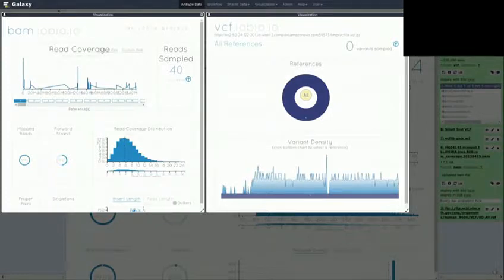And this is the same for variant files. If you have a VCF file, you can visualize your VCF files as well. This is a different interactive environment, a different Docker container, and we can talk to them.